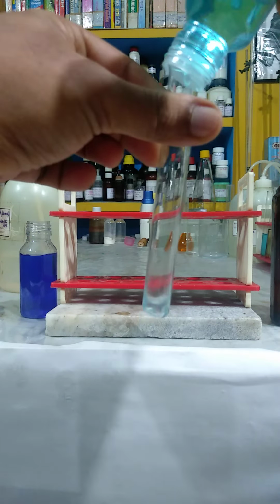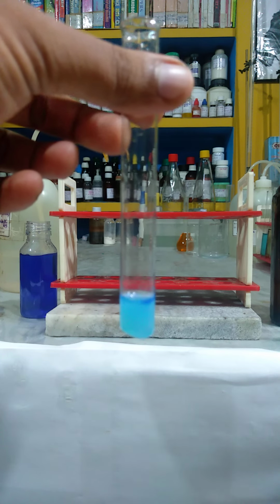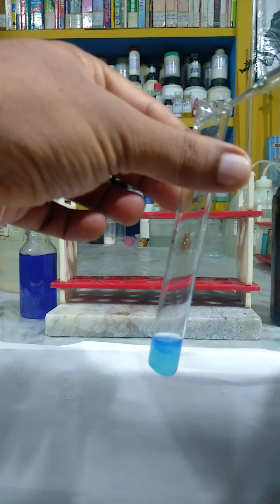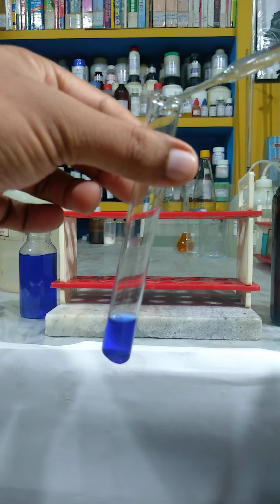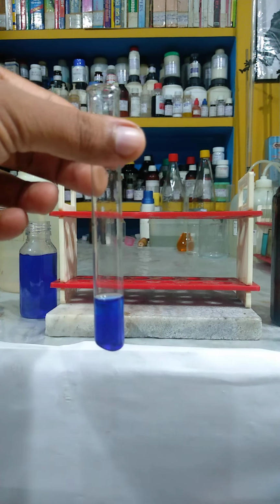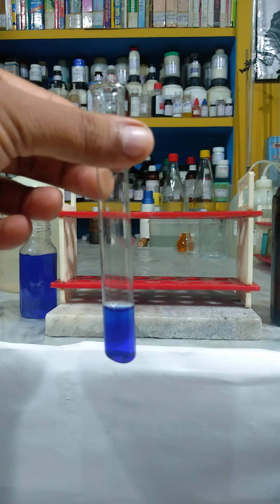See what is forming? Cupric hydroxide, Cu(OH)2. Then I am adding extra or excess amount of ammonium hydroxide in it. See what is the change? Wow! A beautiful color is formed, like deep blue color. It is for cuproammonium sulphate.